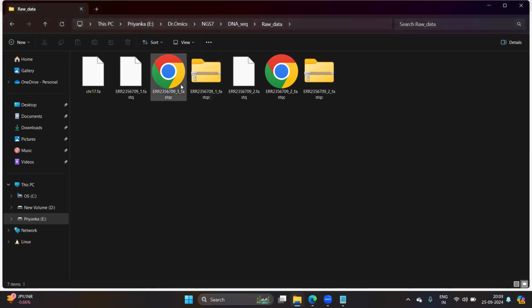So here we are having this HTML file. I told you yesterday that FastQC will give us one HTML file and one zip folder. In this HTML file, you will have the graphical representation of the FastQC report. And in this zip file, we are going to have the summary of that report, right? So let's open this _1, or the forward file, FastQC report and understand the concepts.